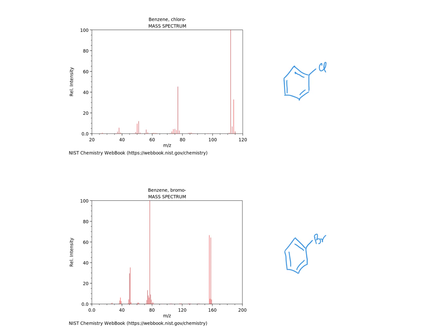Now, the parent ion is one of the things that you need to pay attention to. The parent ion is like, where are these things coming from? What's the overall mass? That's the mass of the spectra, and this we refer to as the parent ion a lot of times. Basically, that is how much mass your compound has. But before I go into that too much, because there's really no need to, since all you're doing is calculating the mass of the compound, I want you to look at this more closely.